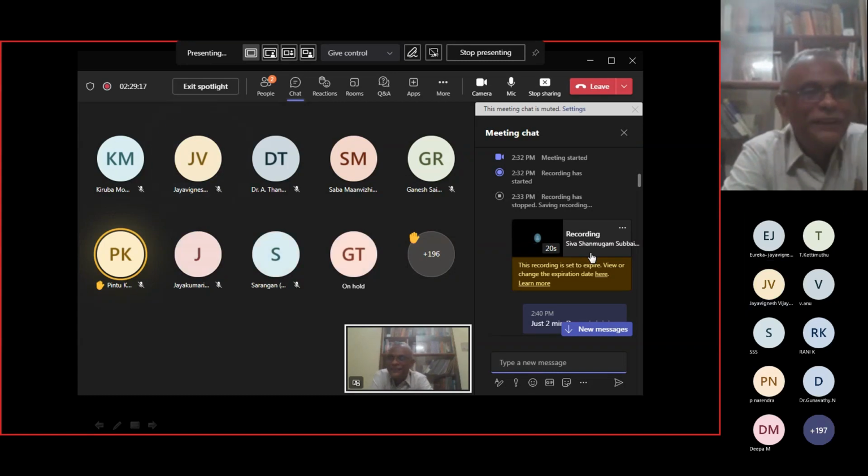It's very difficult for me to answer. See, sometimes the accuracy, in the application, is between plus or minus 1.6%. In HPLC, I have seen up to 0.5% in certain cases, but it all depends on the people who use the technology. In my opinion, we are very comfortable with TLC, and we have never gone for HPLC so far. It is very difficult for me to reply to which requires it and which doesn't. For me, such a requirement never came up. But nevertheless, we cannot ignore HPLC totally.